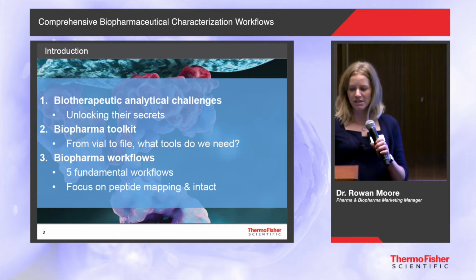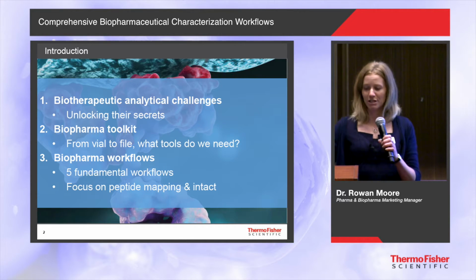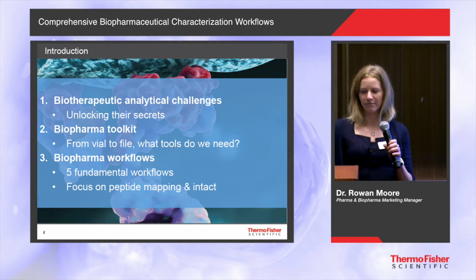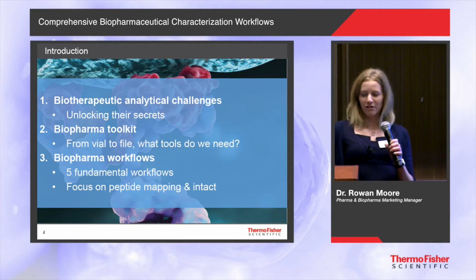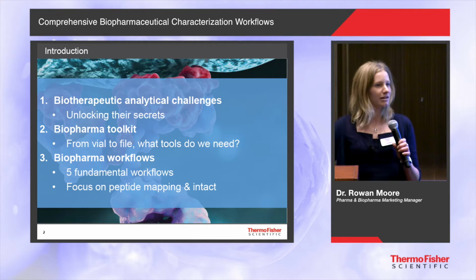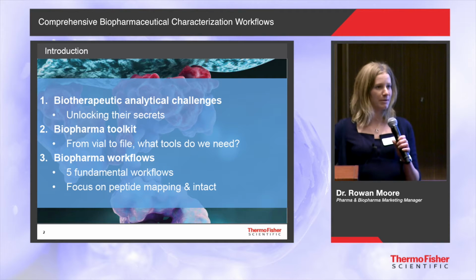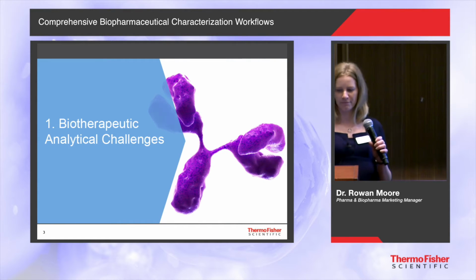As part of this presentation, we're going to be looking at some of the analytical challenges that biotherapeutics present and what tools we might need to unlock their secrets. What do we need in our Biopharma toolkit in order to get from vial to file? And finally, we'll take a look at some of the fundamental biopharmaceutical workflows, and I'm going to focus on some peptide mapping and intact, denatured and native data, which is hot off the press from ASMS.